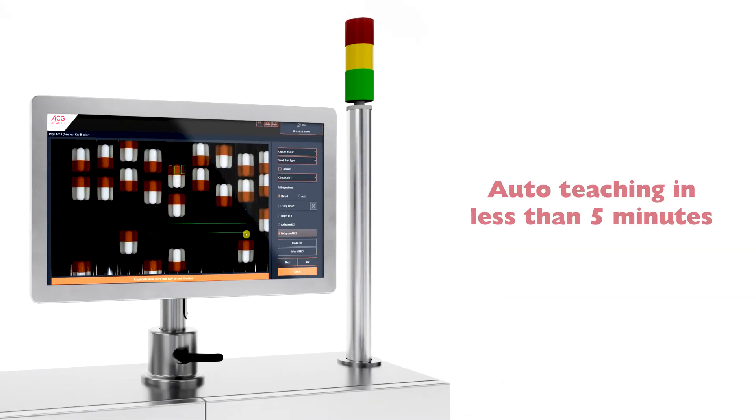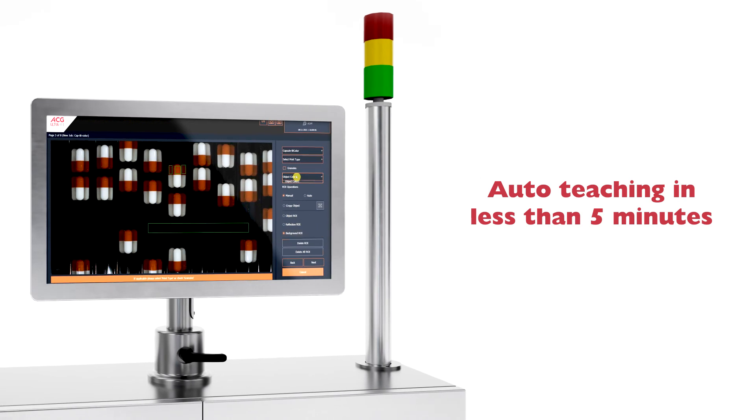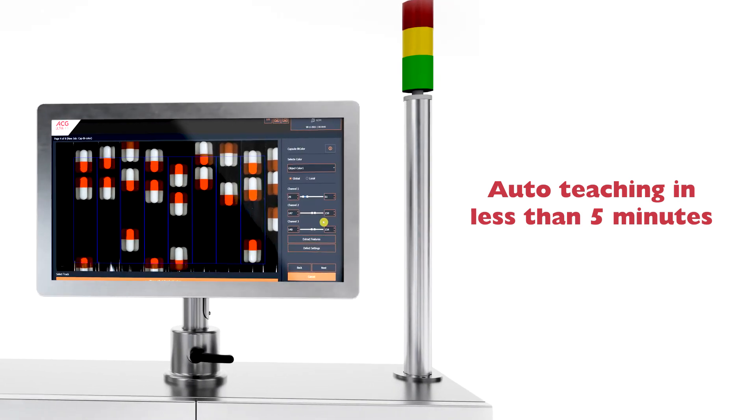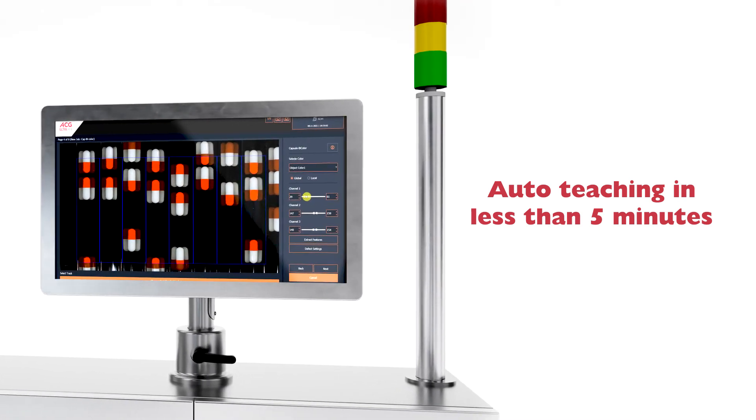QualiShield BF Series has an auto-teach option that takes less than five minutes to train the machine. Plus, it's also AI-enabled.